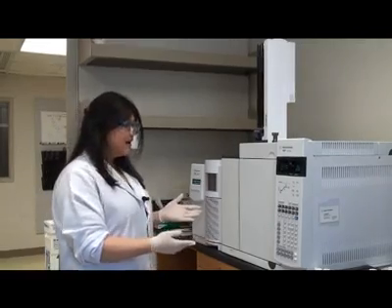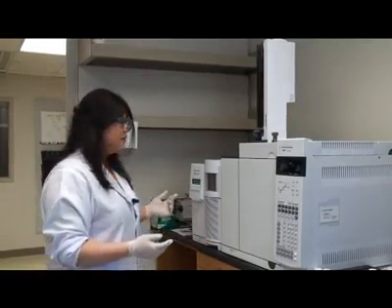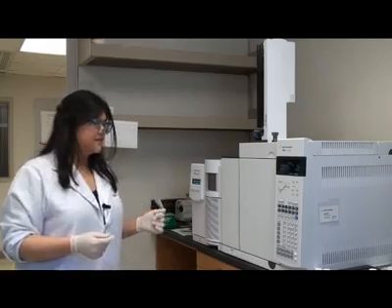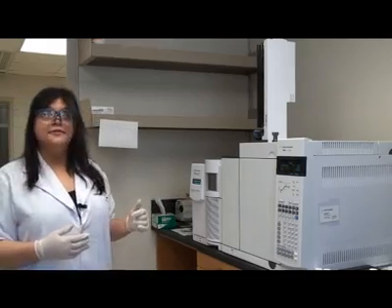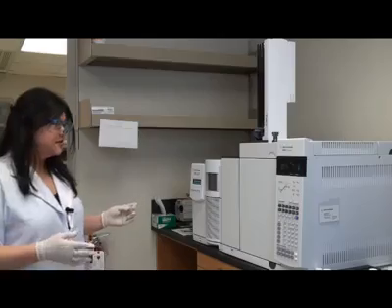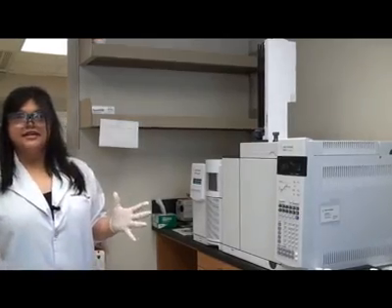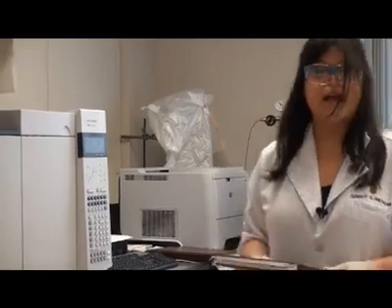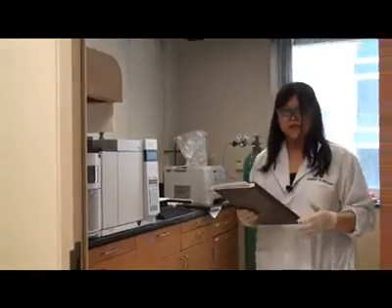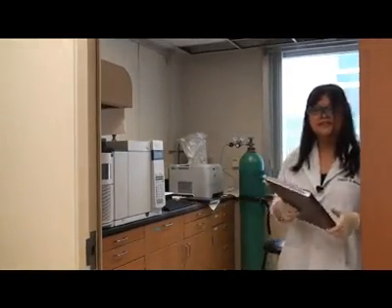Now that the column has been installed in the GC mass spec, we can use the Salvation Parameter model to examine a wide range of compounds to obtain the retention data. Collected all of my data in my lab notebook, we can go to the computer lab and where the probe molecules will be subjected to the Multiple Linear Regression Analysis program.